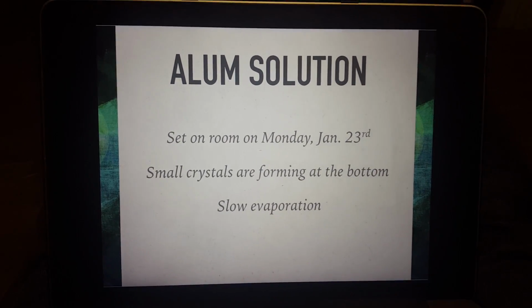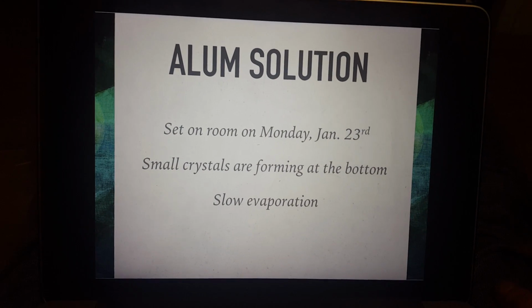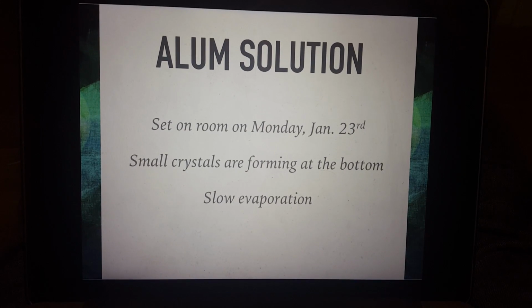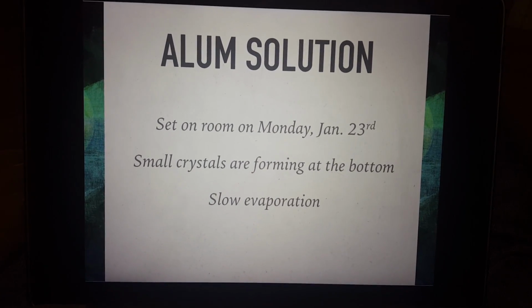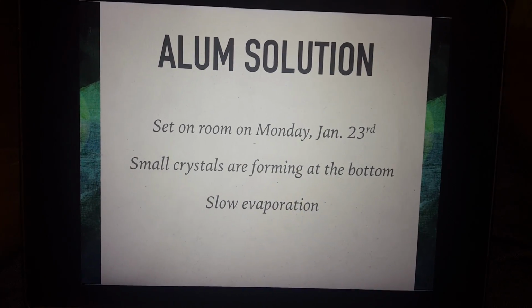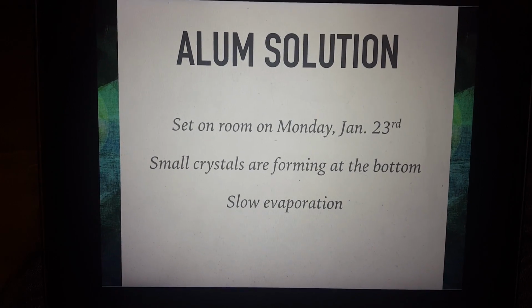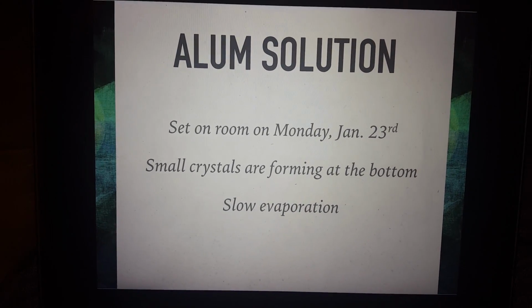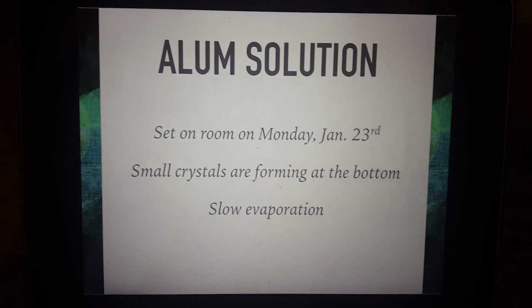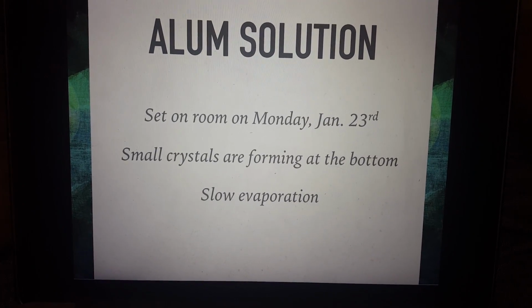So in my second video, I'm going to start by discussing the progress of the alum in the vial, which was set in the room 3 weeks ago on Monday, January 23rd. And there are some crystals already forming at the bottom. It's been slowly evaporating, like the water in which the crystals were dissolved is slowly evaporating because of the cold temperature and the open window in the room, which brings in cold air.